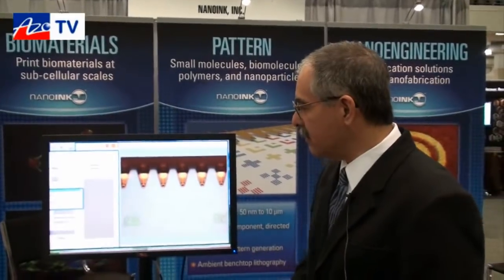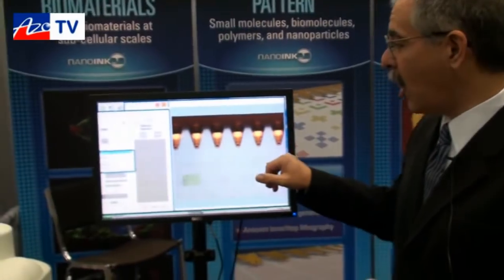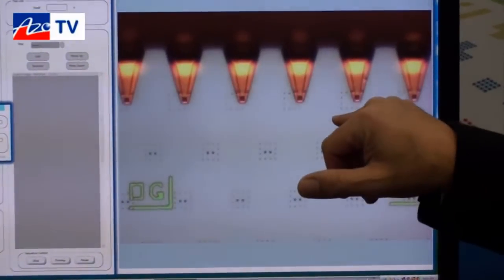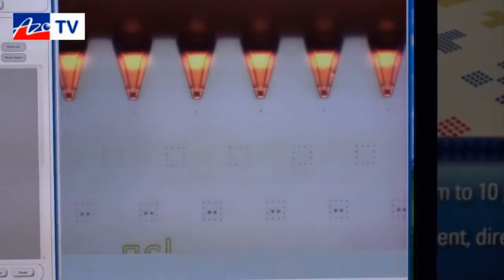Looking at the demonstration going on just behind, what we're doing here is printing an acrylic polymer that's UV curable. As you can see, the spots are very uniform in size, and you can print multiple sizes just by changing the dwell time.